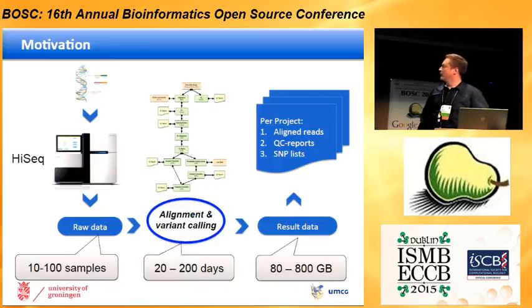And we came to this project because we have several sequencers in our lab, and we also participate in large projects like Genome of the Netherlands, where we had 770 individuals sequenced whole genome, and we ran into the huge issue that we had a large pile of data, and we wanted to do reproducible analysis on it, like alignment, variant calling, SV calling, etc. And we also quickly ran into the scalability issues, like Piotr also already mentioned.